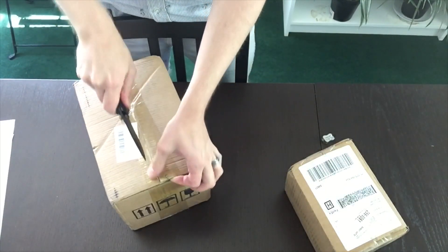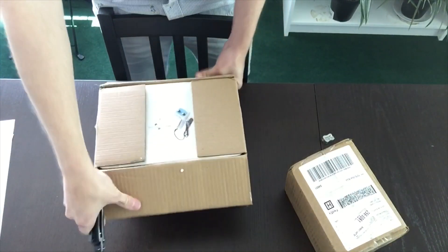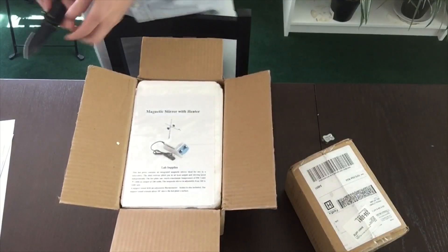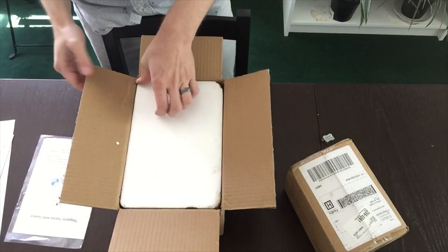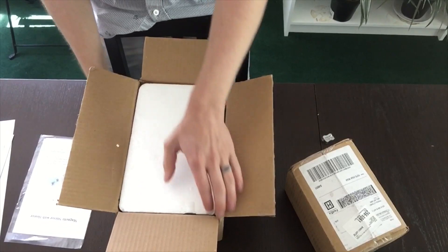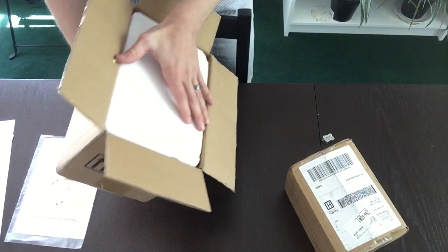Here I'm just opening the package. It actually was smaller than I had anticipated. I thought it was a larger size comparable to ones I've seen on YouTube, but it turned out to be about half the size that I thought it would be. It comes with a manual that's pretty easy to read — no typos or weird grammar, which is encouraging.